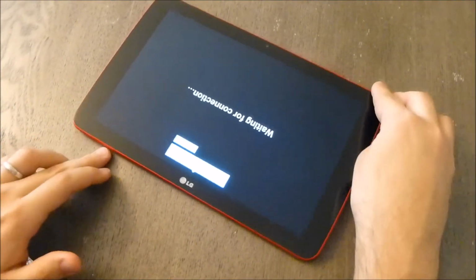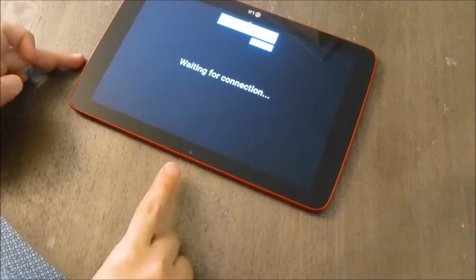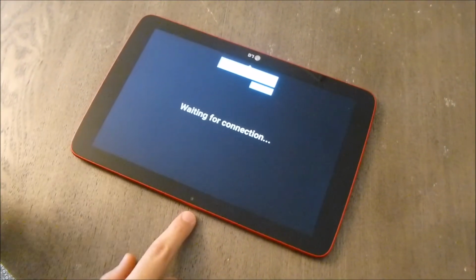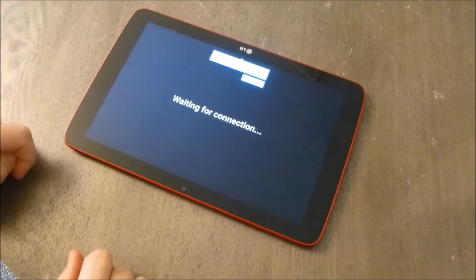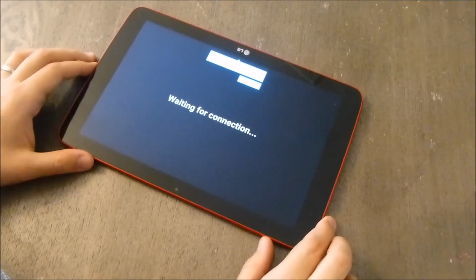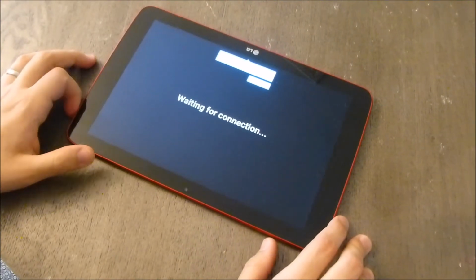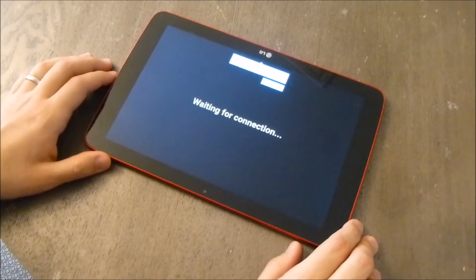So actually the app is intentionally in this orientation so that the camera's on the bottom, and when you mount it in the acrylic enclosure, the camera is kind of like in the center and is more likely to pick up the face of the animals or whatever is in front of the SMARTA apparatus. So it's okay if it's upside down. It's meant to be upside down, and if you watch the rest of the videos about mounting it in the acrylic enclosure, you'll see how that makes sense later.